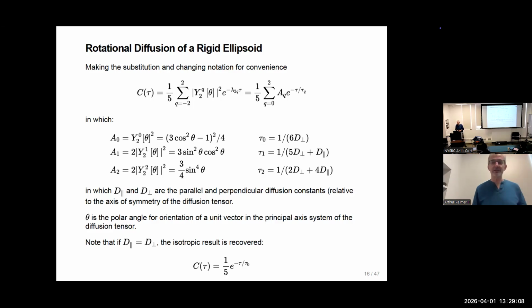So this is quite nice actually for NMR, because for example, in a globular protein, if we measure N15 relaxation, we'll tend to have NH vectors pointing in many different directions. So if we have a crystal structure and we know the angles in the crystal frame, the crystallographic frame, then we can figure out the rotation that goes to the molecular frame and get the diffusion constant.